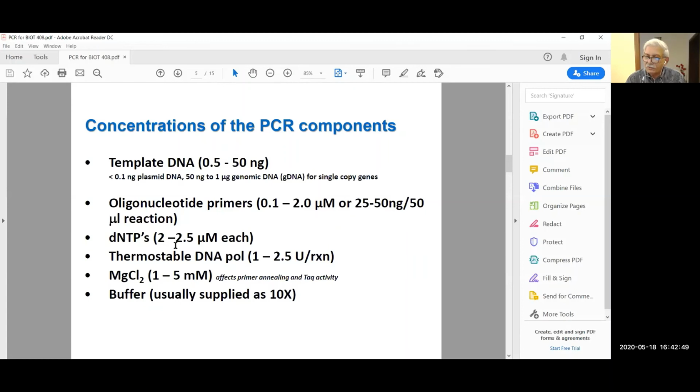And what would be the concentration of each dNTP in that 100 microliter? We took 1/4 volume of each one. So divide the total concentration by 4. 100 millimolar divided by 4 is equal to 25 millimolar each. Do you understand? Yes, sir. Okay, because when we mixed one dNTP with the other ones, obviously we diluted that dNTP. We combined 4, so every dNTP had a 4-time dilution. It dropped from 100 millimolar to 25.